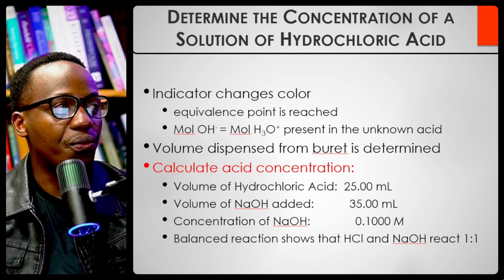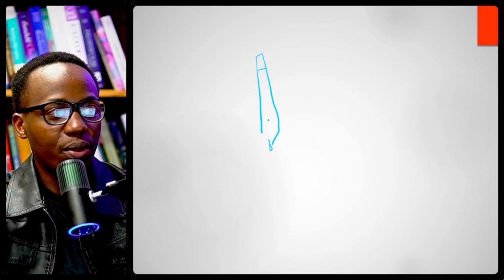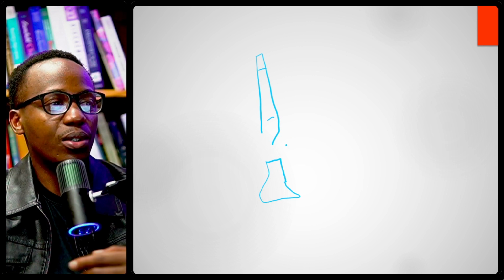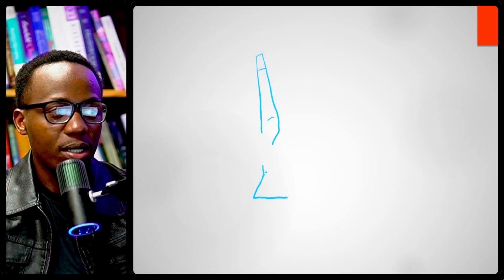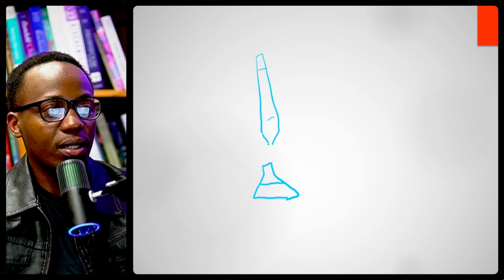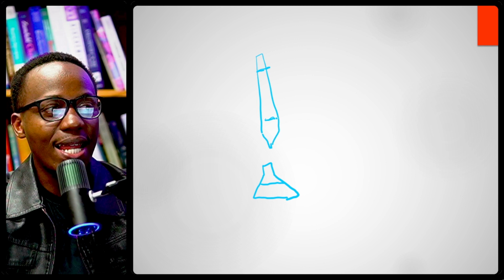All right. So if you have done your titration correctly, which I know you will, you're going to have your burette here, and then you're going to take a reading. The first reading and the second reading of the burette. And then you're going to know how much you put in your flask. Ooh, that is not a good drawing, but it's hard to draw this way. But okay, so you will know how much you put in your flask. You're going to titrate until the color change. So you will write down the beginning and the end of your color.